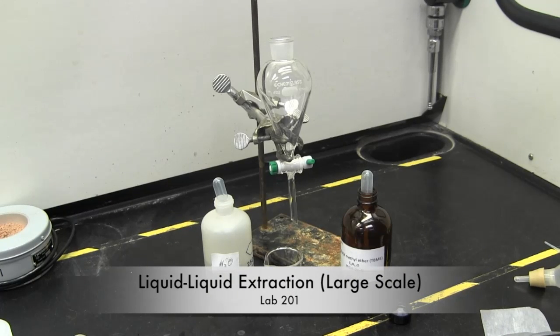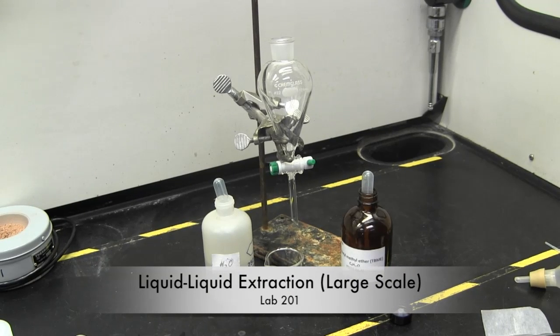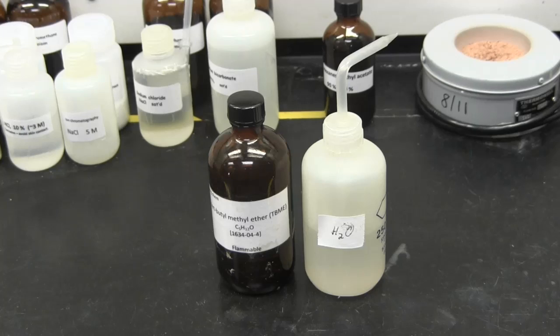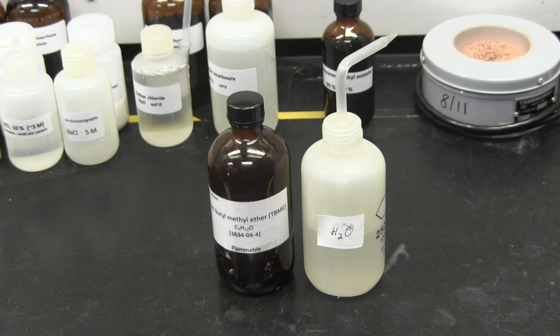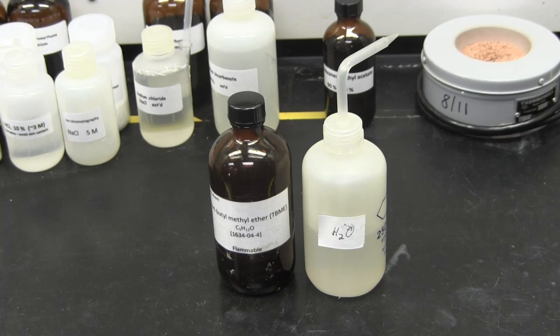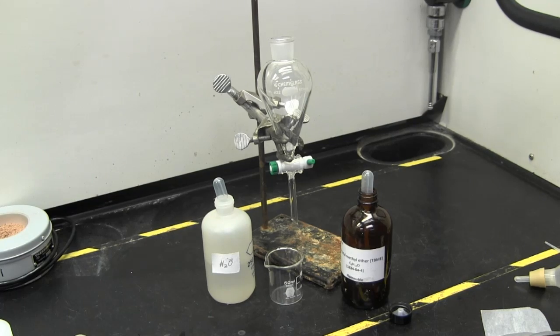In this lab, we will learn how to use two different solvents to separate two different solids. We will be doing this with a large-scale setup. The solvents we will use are TBME and water. However, you could use any two solvents, as long as they don't dissolve in each other. In most cases, one solvent is water and the other solvent is an organic liquid.